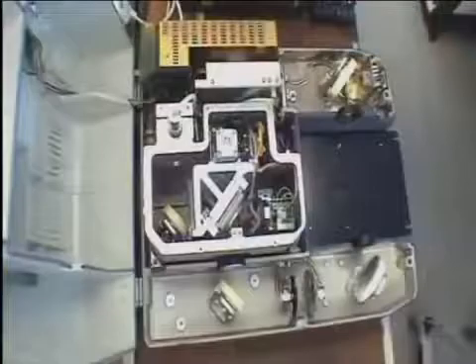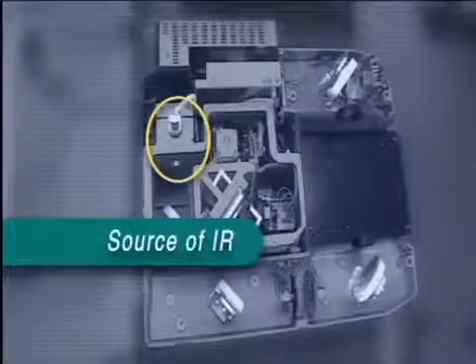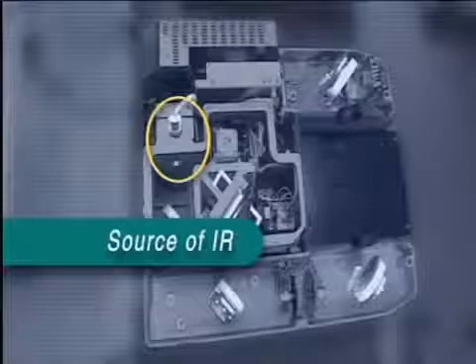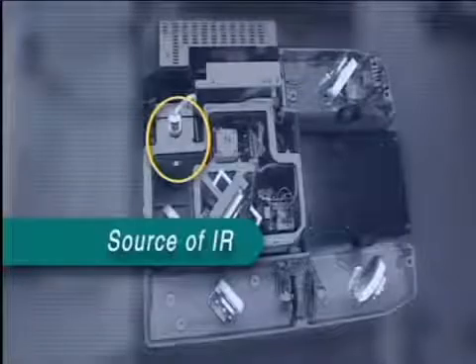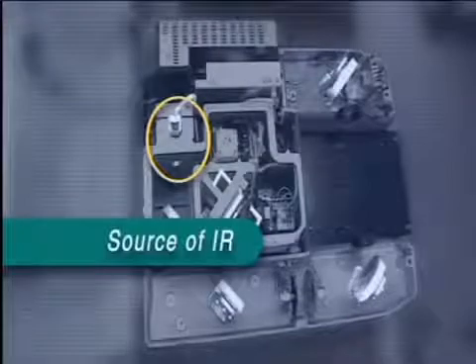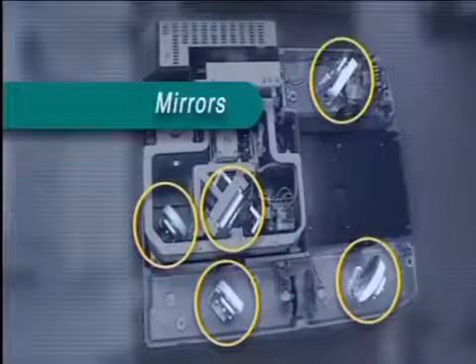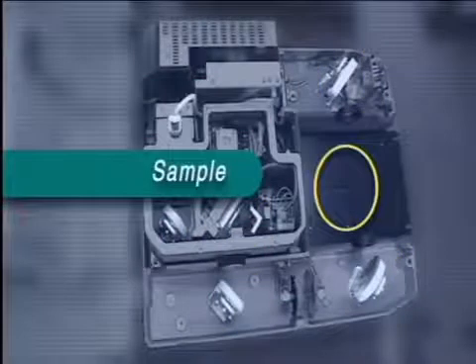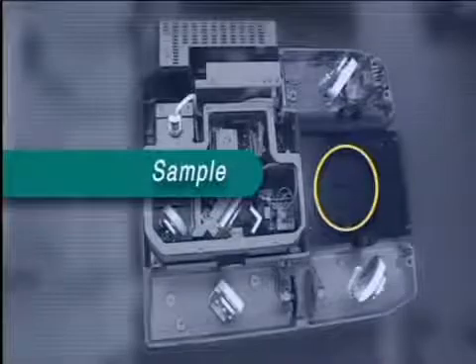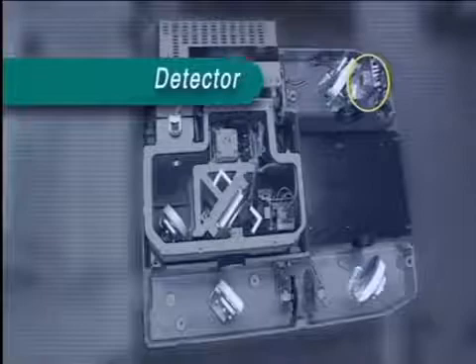All IR instruments have a source of IR radiation. This is a coil of wire surrounded by a ceramic capsule, which is heated electrically so that it gives out IR radiation. In other words, heat over a whole range of frequencies. The IR radiation goes via a series of mirrors into the sample, which is placed here in an appropriate holder. The radiation not absorbed by the sample arrives at a detector situated here.